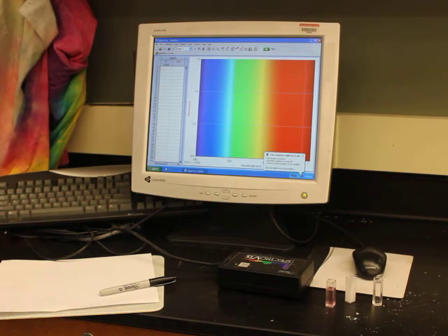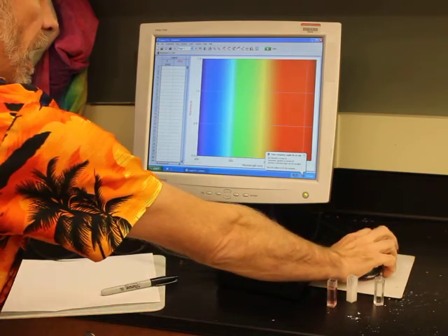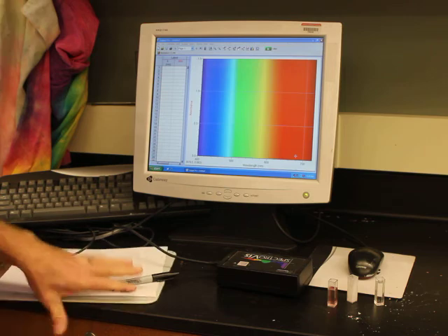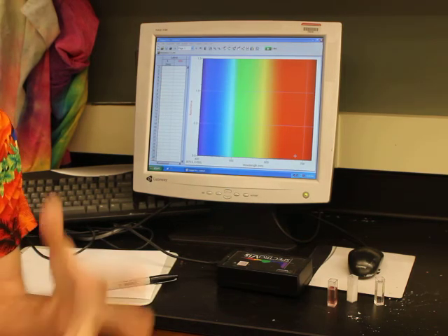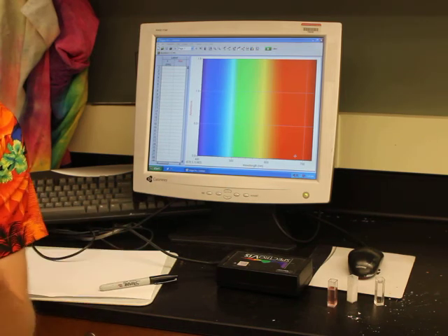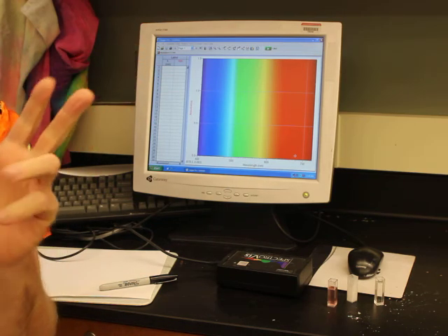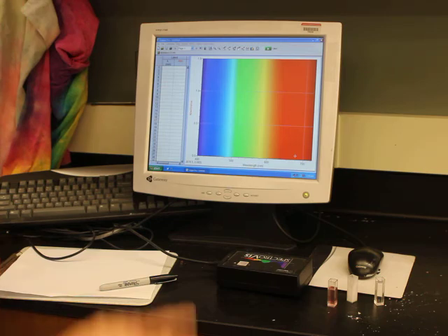So today we are using our new tool. Our new tool that we're using today is a spectrometer, right? Think thermometer, the origin of the word, therm meaning heat, meter meaning measuring it. So a thermometer is a thing of measuring heat, temperature. Spectrometer is a meter that measures spectra, right? So it's a light measurement.